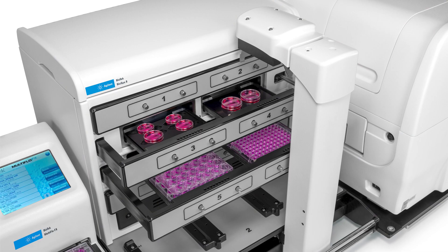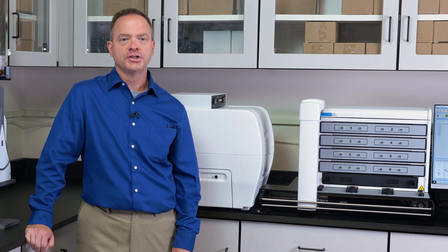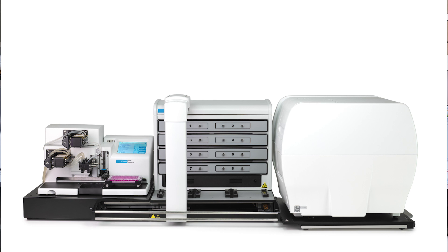The BioSpa can process up to eight different vessels at the same time including microplates, microscope slides, dishes and more. If liquid handling is also required for your workflow such as media exchanges during long-term cell-based assays, reagent additions or plate washing, a plate washer or dispenser can be accessed by the robotic arm on the left side of the BioSpa with the detection instrument still being accessed on the right side.